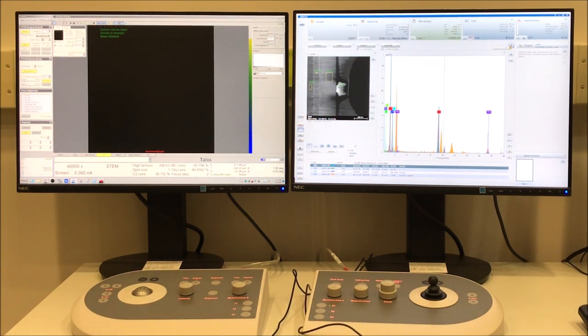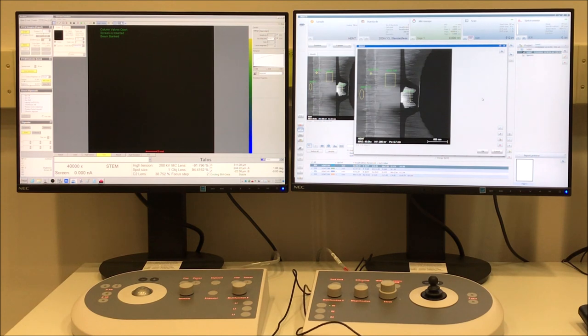And the first thing we want to do is send this to the project. So there's that double arrow in the upper right corner, and then you can send to project. And then if we open that folder in the project configurator, we see there's an image entry. That is your image. You can use that input output icon, which again is the two arrows, to save that image.